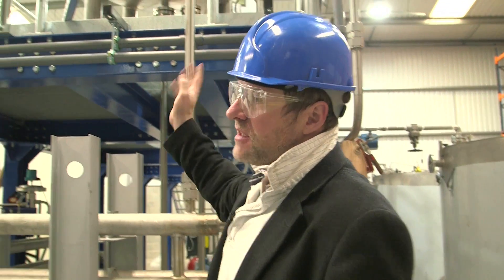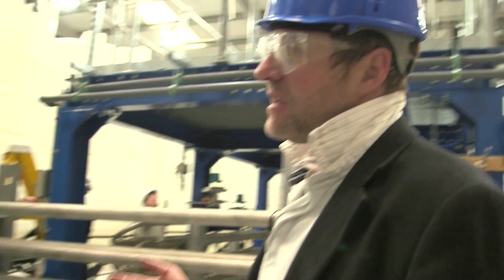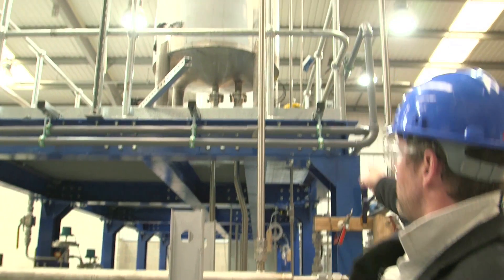That will then go into this boiler here. This is a monster boiler that we've had specially manufactured, and that will take the heat right to the temperature that we want - the target temperature. That then gets pumped back into the reactor.